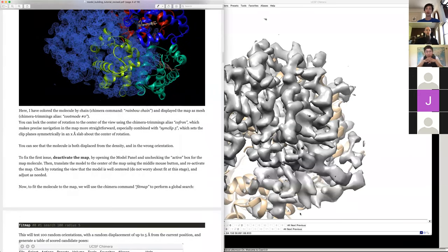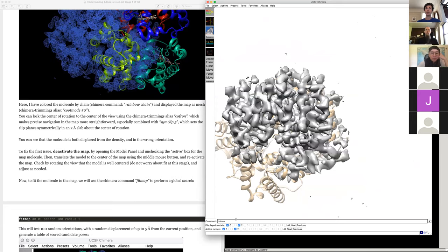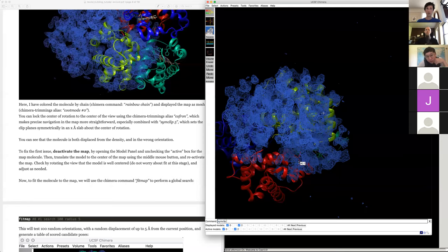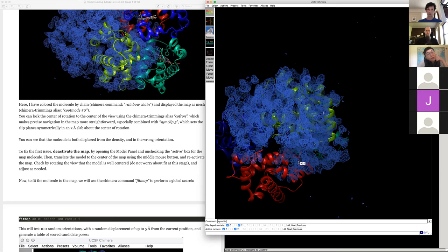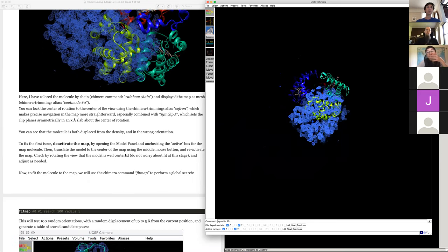Next we'll reorient the model within the map and adjust a few display settings. I prefer a mesh map since I'm used to Coot, so I use a little alias for that. Then I'll do 'rainbow chain' and 'sim clip' — sim clip adjusts the clipping planes symmetrically around the center of rotation so you have a slab of density, making everything more visible. Let's do 'sim clip 15' or so.